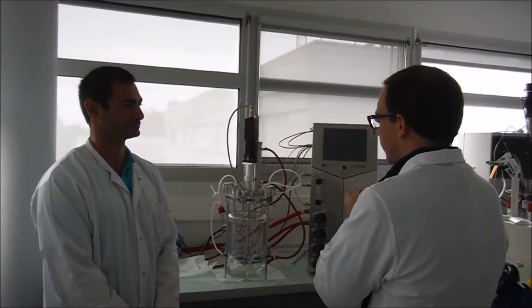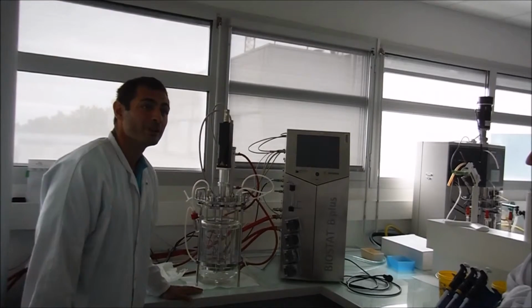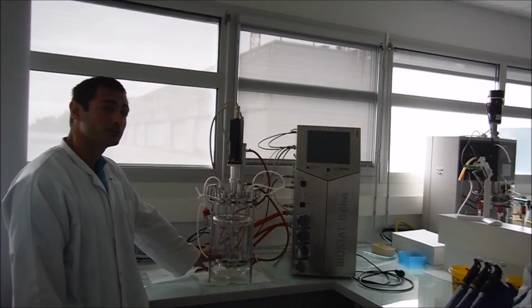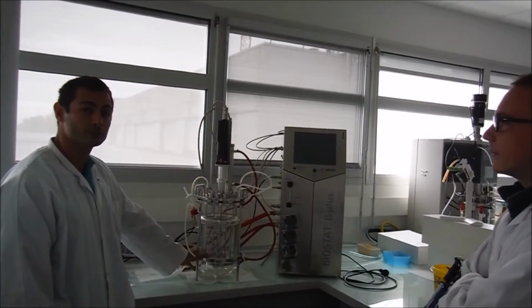So let's get more information about the bioreactor with Laurent, my colleague at ENSTBB. Hi Laurent, can you describe the system please? Hi, you can see there a 5 liters bioreactor which can be inoculated with preculture.